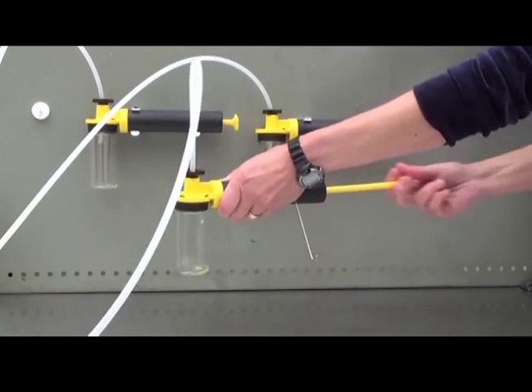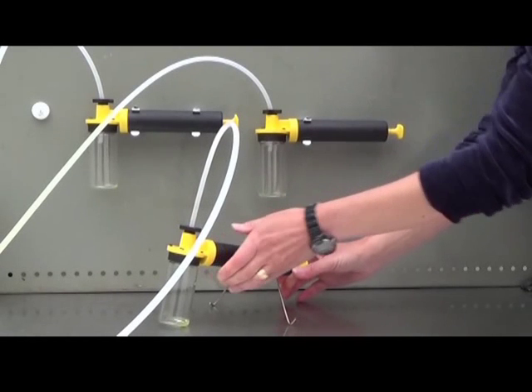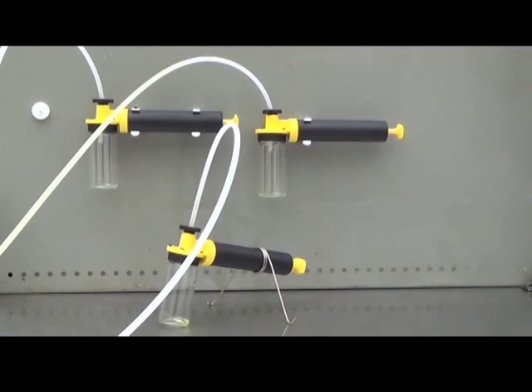The pumps are then clamped up by magnetic tool holders, enabling you to work on something else whilst the vacuum fills the bottles to the desired level.